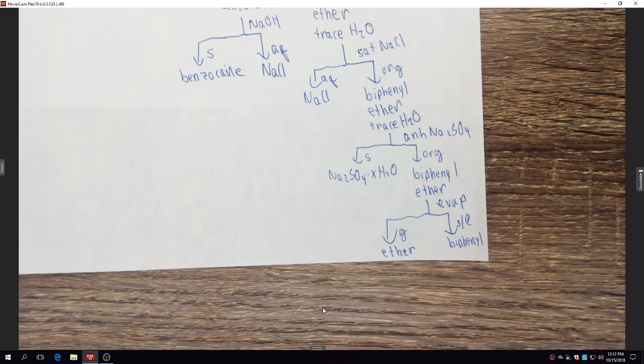One really key thing that I could tell you about melting point is please go slow. All right, don't crank that thing up as high as you can and let it fly through a range of temperatures. Especially when you're near where you think the melting point is, heat it slowly. Because if you heat it slowly, you have a better chance of actually seeing when it melts and the tube actually being that temperature. If you crank it up, what happens is it's really a lower temperature than what it says it is. All right, because it takes time for something physically to heat up.